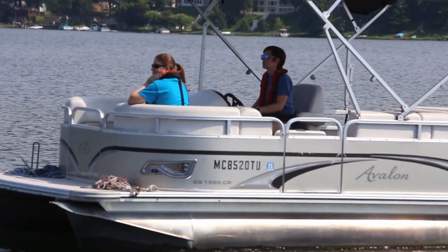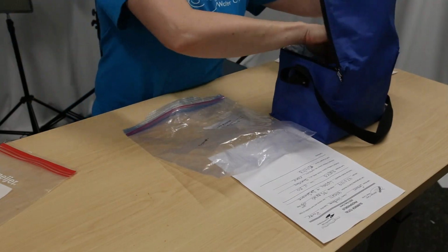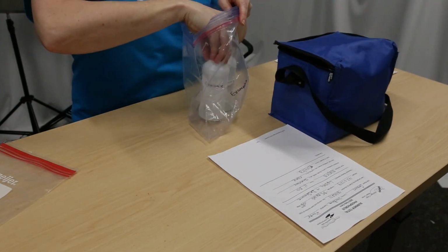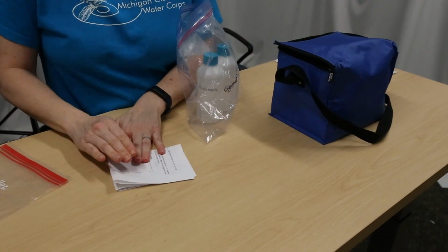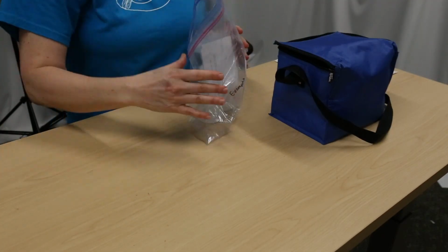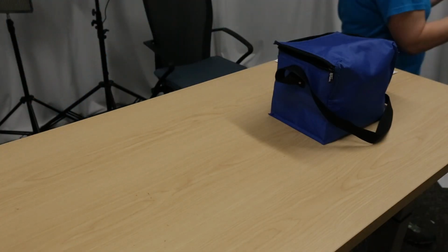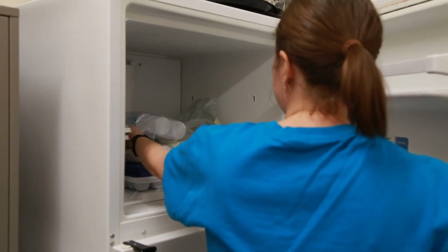Once you return to shore, you will need to freeze the water samples immediately. The samples go into a zip-top bag with your lake name, county, and field ID number. Fold the data sheet, place it into a separate zip-top bag so it stays dry, and place that in the bag with your samples. Storing your data sheet with the samples is a good way to make sure the paperwork never gets lost. Once you're done, store your samples in the freezer.